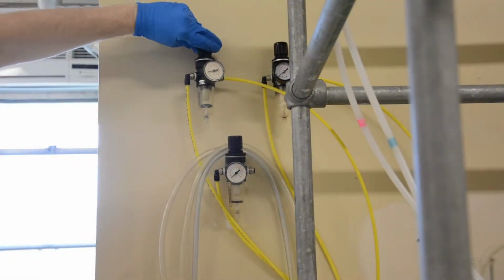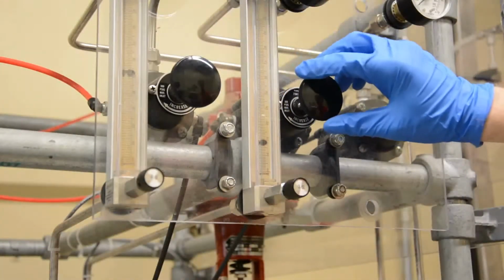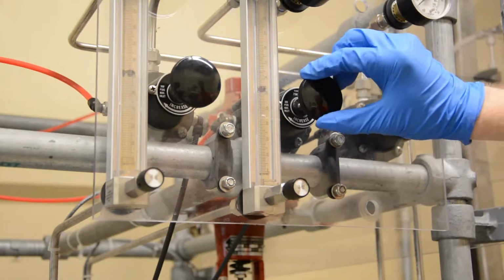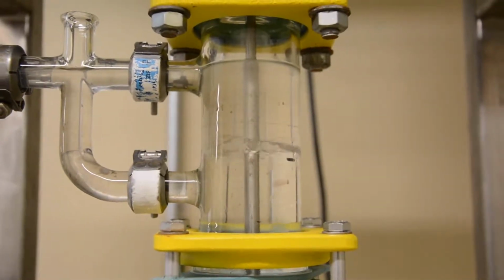Fourth, turn on the two air valves. Fifth, turn the air flow rate valves on the wall. Sixth, turn the flow rate valves for the heavy and light phase to fill up the column.